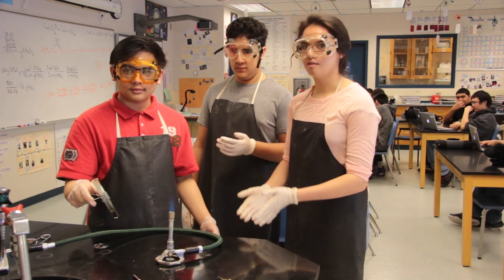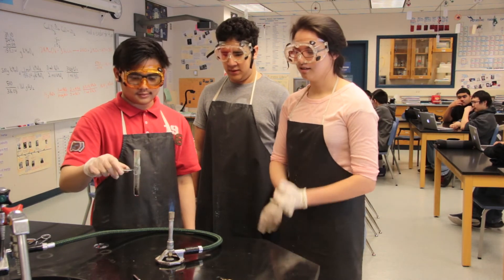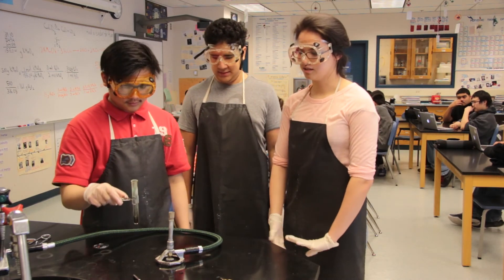And you can see the copper oxide inside the test tube turns black after the decomposition reaction occurs.